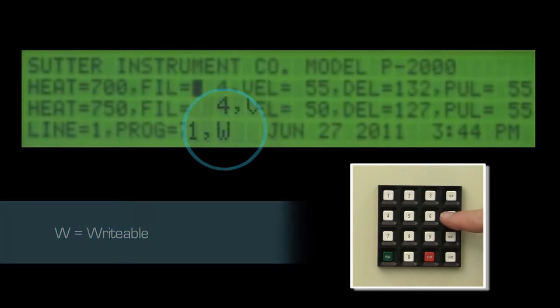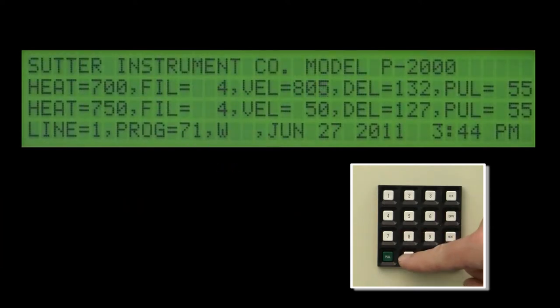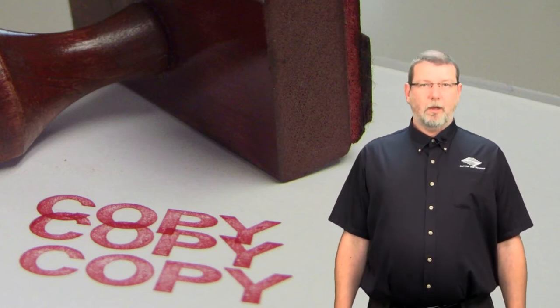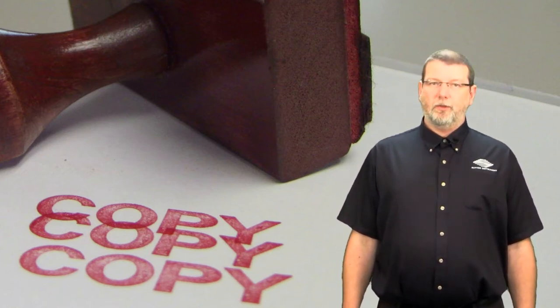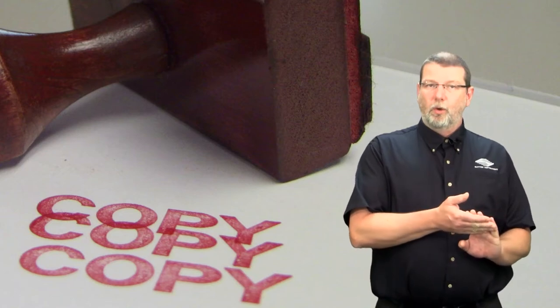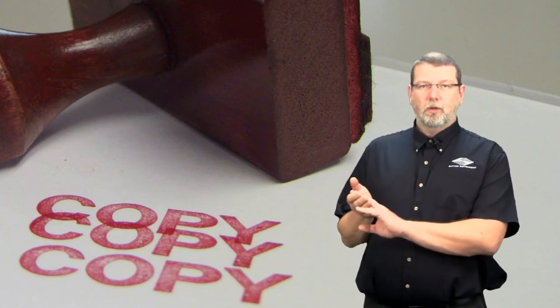Now we can make edits to the newly copied program, for example the velocity on line 1. The copy feature on your Sutter P1000 or P2000 puller enables you to develop a derivative of an existing program — that can either be a sample program that came with your puller or a program you received from one of your collaborators.